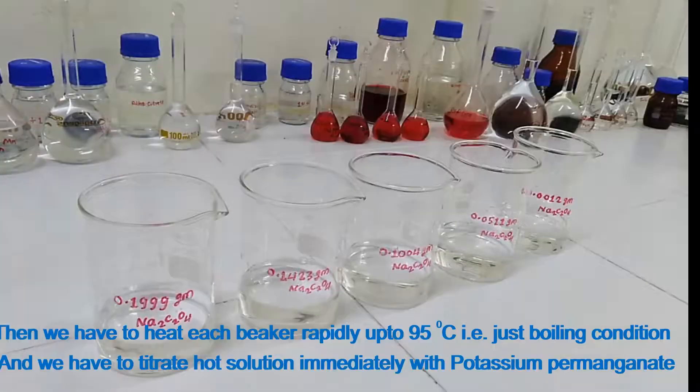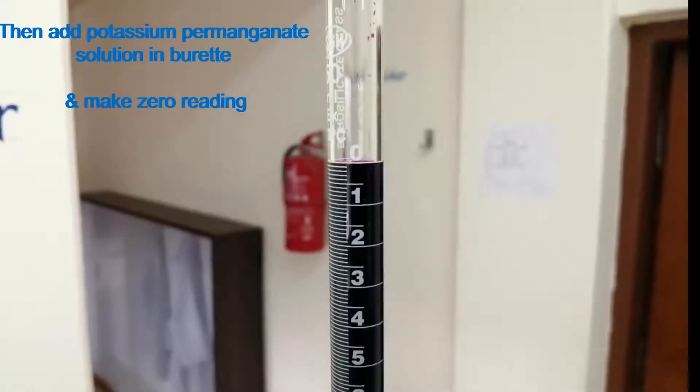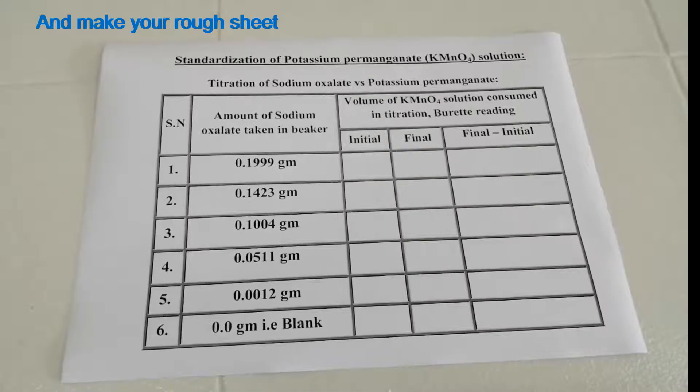Then we have to heat each beaker rapidly up to 95 degrees Celsius, that is near boiling condition, and immediately titrate the solution with potassium permanganate. Add potassium permanganate solution into the burette and make a zero reading. Make your rough sheet.